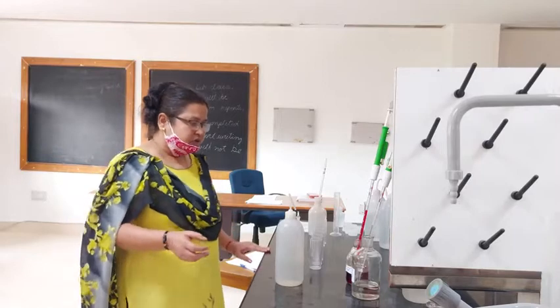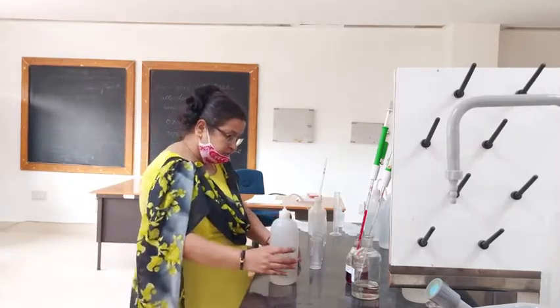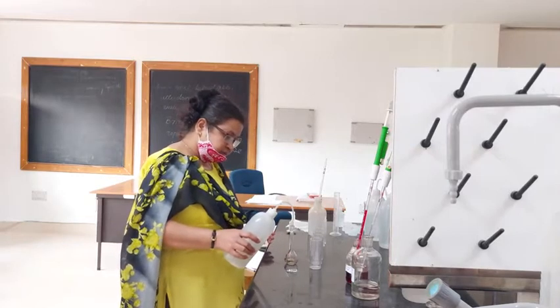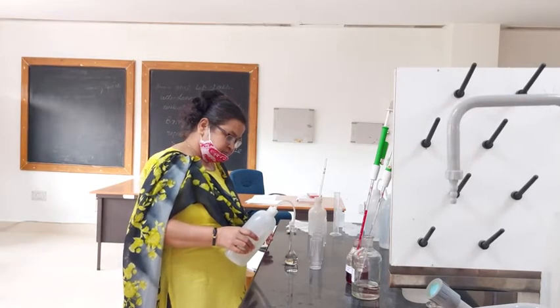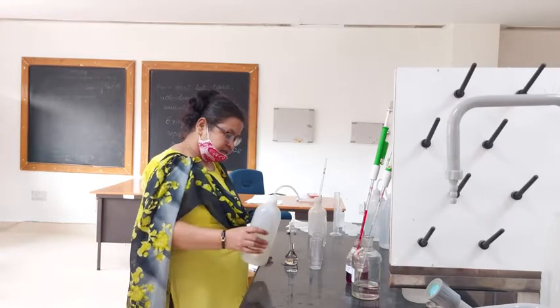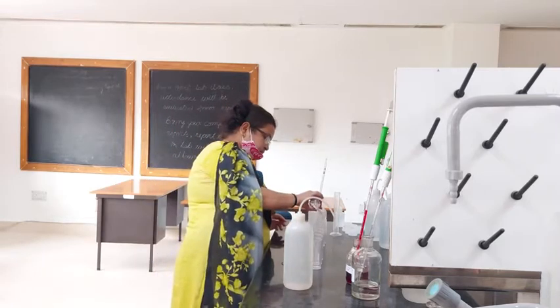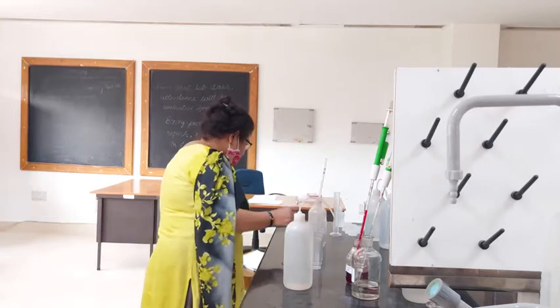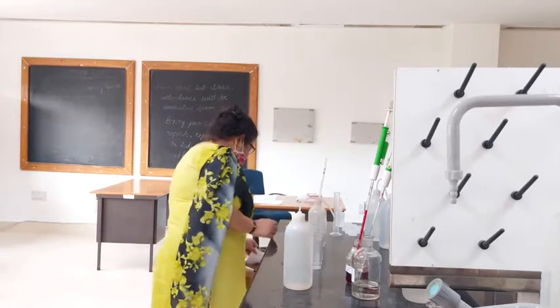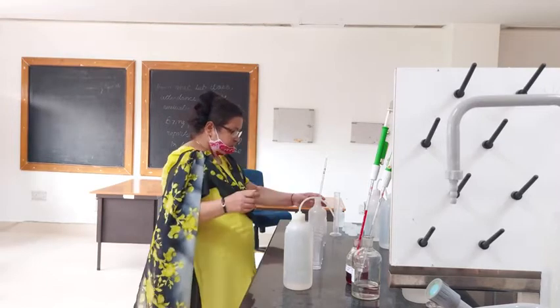First I will show you how to prepare the standard. First is the blank. So I need to measure 50 ml of the distilled water in a volumetric flask and transfer it to specimen tubes. Specimen tubes are already numbered. Then for the first standard, we need to take 2 ml of the standard fluoride solution.